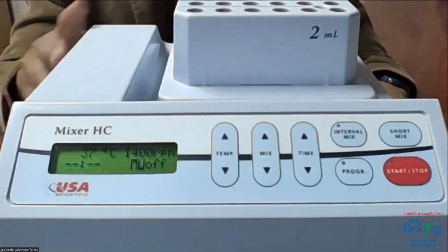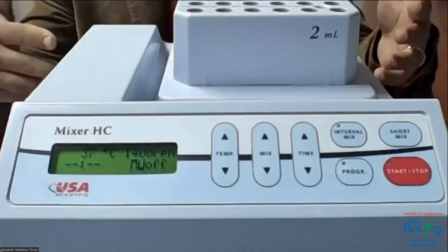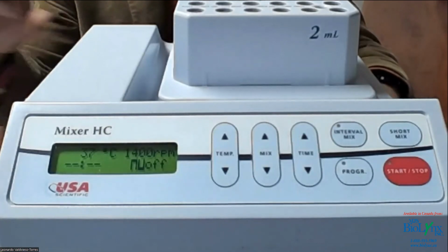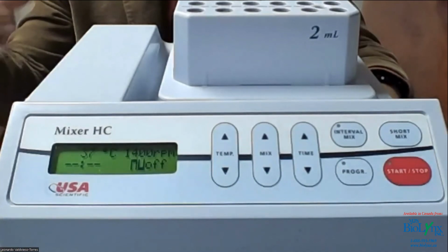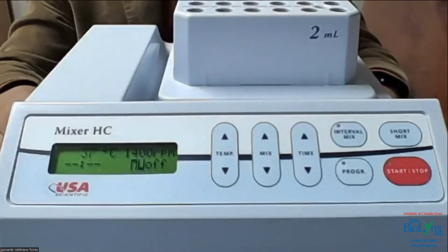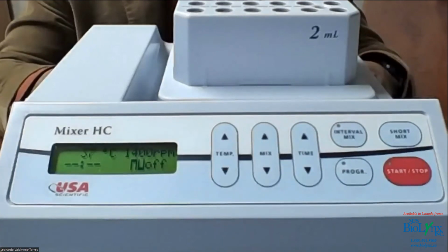It is really nice because you can turn it on and off. You turn it on when you go to work, and then you turn it off. One thing we try to tell customers is to be eco-friendly, so it might be good to set up a timer, so it turns on, let's say, at 8 in the morning and turns off automatically at 6 or 7 p.m. That's more ecological, and you're not wasting electricity. So I'm a big fan of not keeping it on all the time if you're not using it.